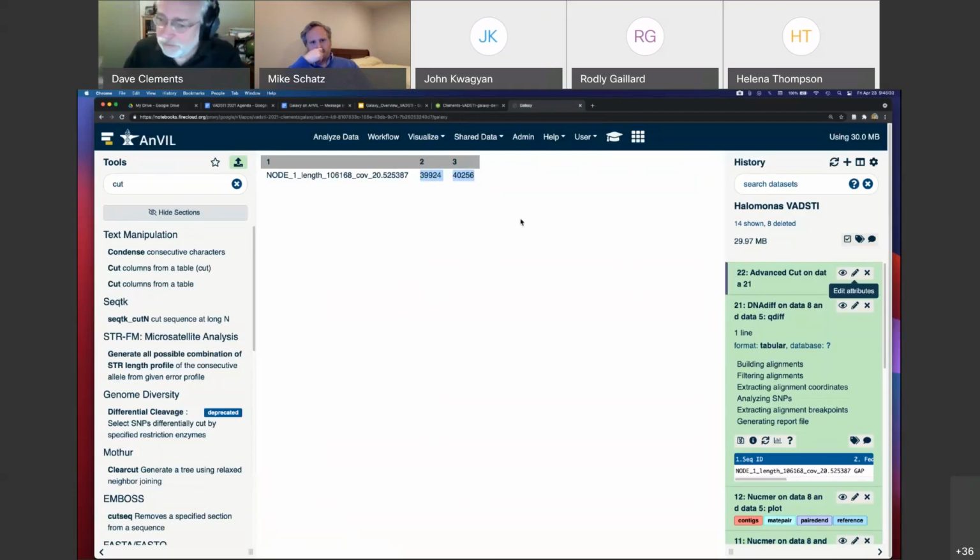Okay. I love this example, and Mike created this example because it highlights both how cool it is to do analysis and get cool results, and how you can string together all these tools. It also highlights how tedious parts of bioinformatics are. And one-off errors are about as tedious as it gets. Okay, so we're going to fix this.